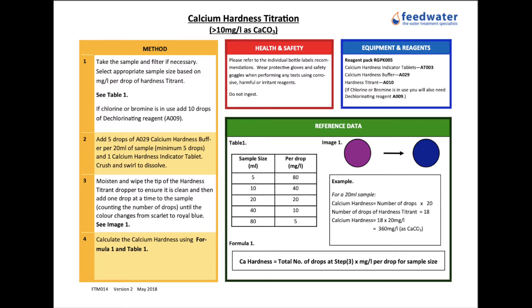Today we are going to demonstrate a field test method for measurement of calcium hardness in water samples. This is a titration method and the reference code for this method sheet, should you need to request it, is FTM14 or Reagent Pack 5. This method can measure calcium hardness levels of greater than 10 mg per litre.